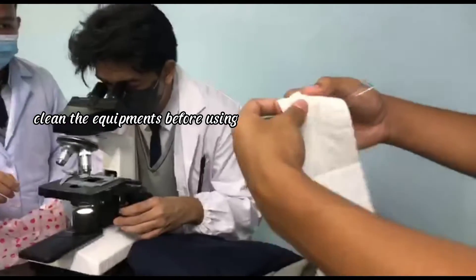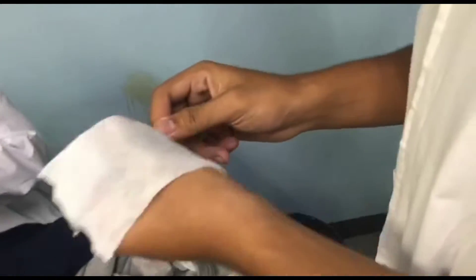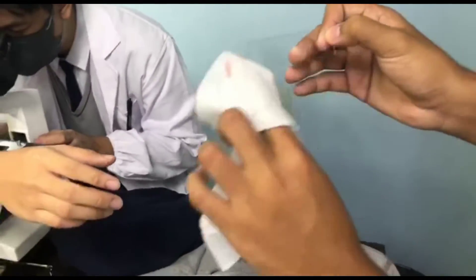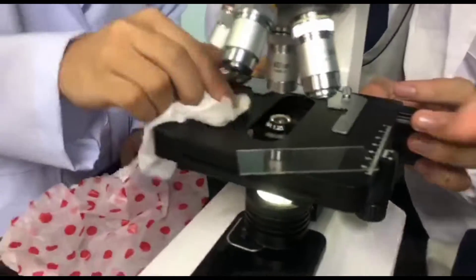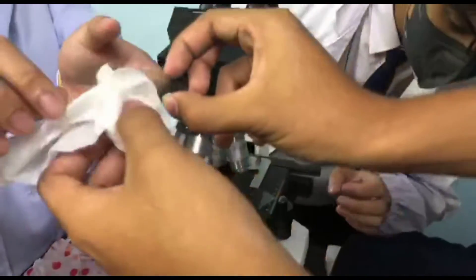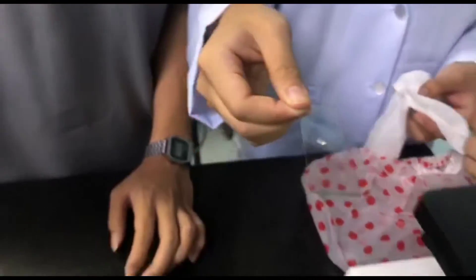Laboratory day procedure: clean the equipment first before using. You need to use a dropper, but we don't have it, so we use a carton as an alternate. Then, a drop of water on the slide.